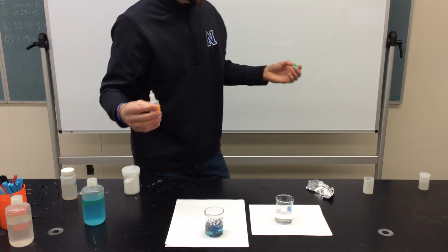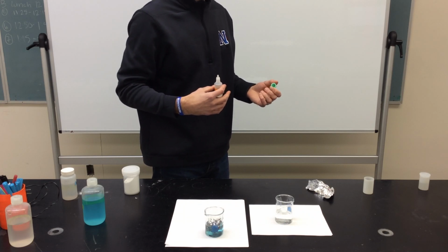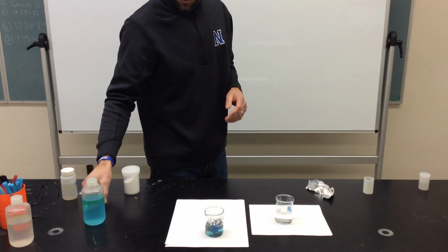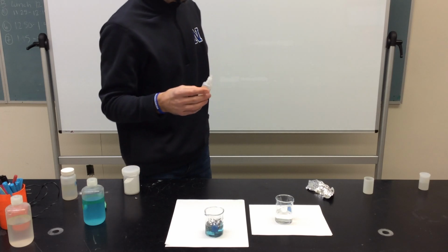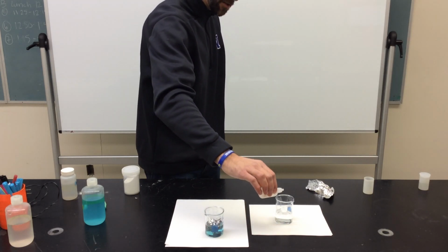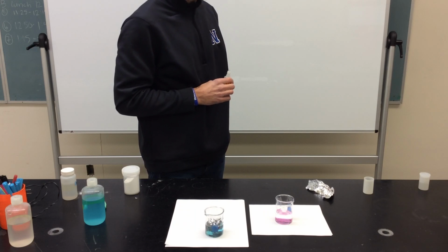So what's going to happen when we put two clear, colorless liquids together? Anybody? You're going to get a reaction. And what would that look like? A clear, colorless liquid, yeah, it'd stay clear. Okay. So we've got some options here. We've got a reaction. We've got two clear, colorless liquids equals a clear, colorless liquid. Well, let's watch and see what happens. So we'll put some drops of the sodium carbonate in there. Was it a clear, colorless liquid that resulted?